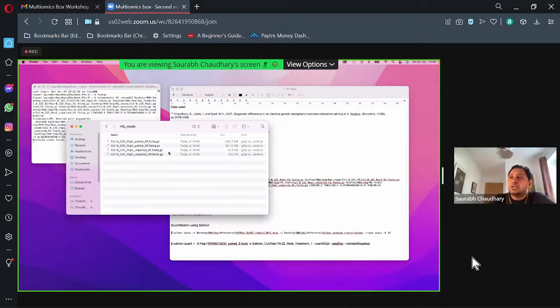What Trimmomatic does is it can take all unpaired reads and make another file. If you want more reads, you can use these reads as single end. But if you get a sufficient number of reads in your data, you can perform analysis with these paired end reads. So this is the file.